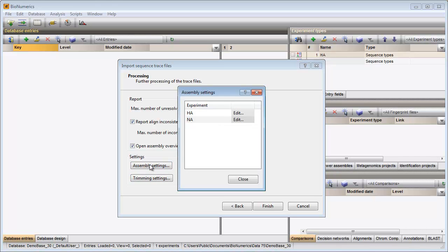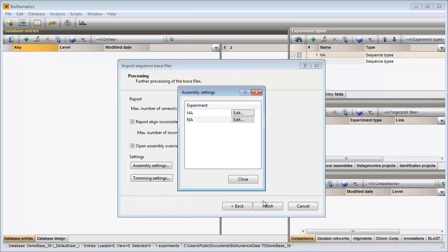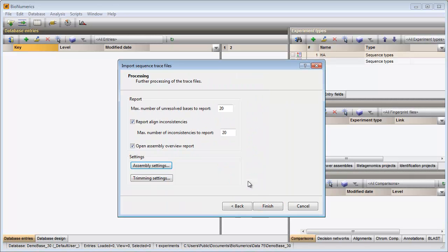Pressing the assembly settings button allows me to change the assembly settings for each experiment. I will use the default settings in this import round, so I can just close the windows. The final step is to click finish and the software will start assembling the selected trace files.